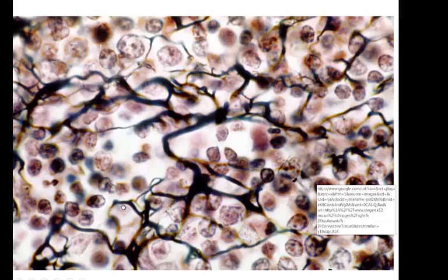So I think I've said it all. In reticular tissue, you find mostly reticular fibers, and the location would be in the spleen, the bone marrow, or the lymph nodes, and the function would be to form a nice soft stroma, a nice soft skeleton to support cells.